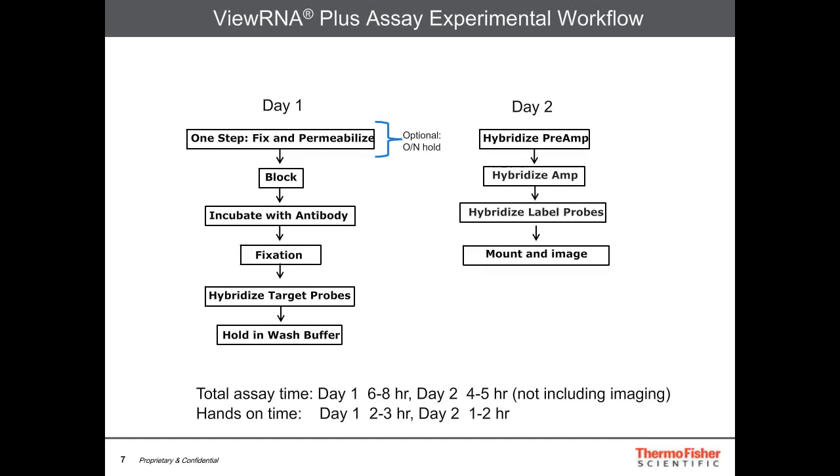signal. So the total assay time on day 1 is 6 to 8 hours, and on day 2 is 4 to 5 hours, and this doesn't include imaging time. And the hands-on time is 2 to 3 hours on day 1 or 1 to 2 hours on day 2.